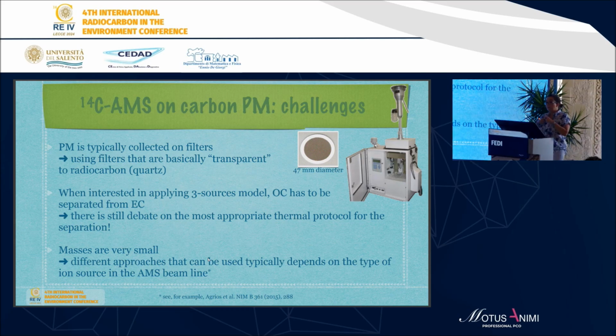But as I told you before, our interest is to apply different techniques on the same filter just to reconstruct all the story of the particulate matter. So not only what about carbonaceous particles, but also what about, for example, silicon, aluminum, and all the other heavy elements.